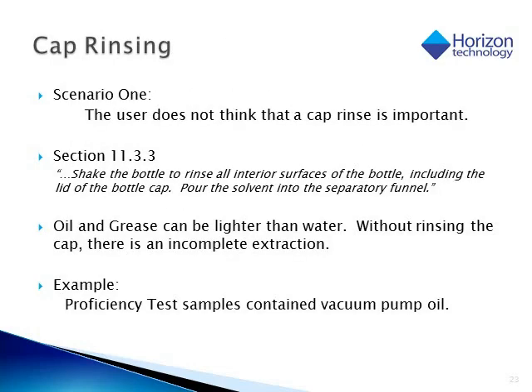You said I have to rinse the cap? Why is that important? It's important because a lot of oil and grease floats on the water, and you can be missing a significant amount of the extractables by not rinsing it down. Let me give you an example. A few years ago, there was a company selling PT samples which had vacuum pump oil rather than hexadecane and stearic acid mix. Horizon Technology got more than a few calls where the underlying problem was that the user was not rinsing the bottle cap.